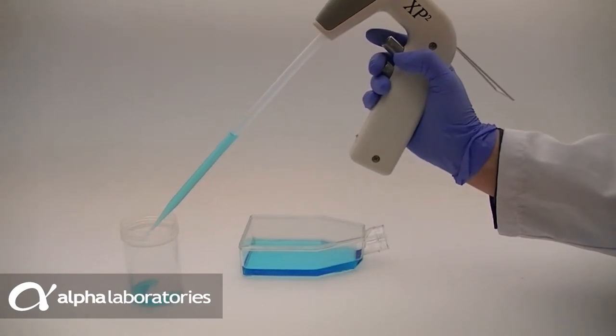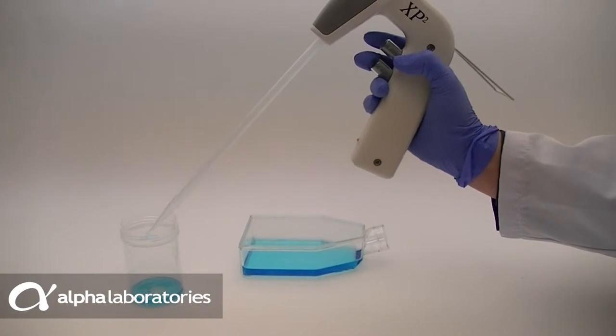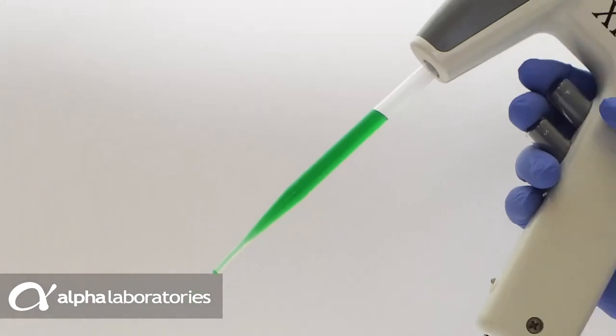Manufactured from low-density polyethylene, they are safer to use than traditional glass or polystyrene pipettes. Being flexible and soft, they also protect your cell cultures.